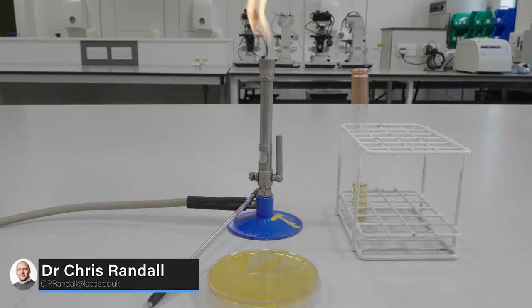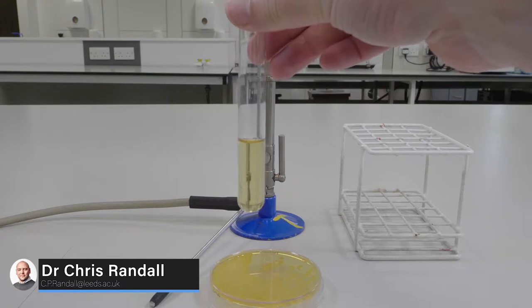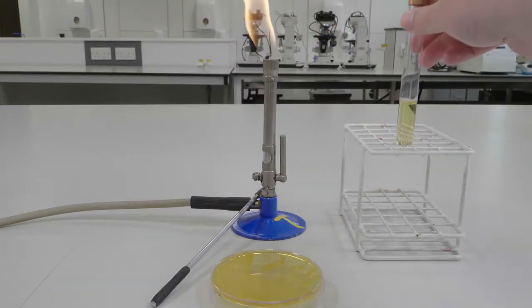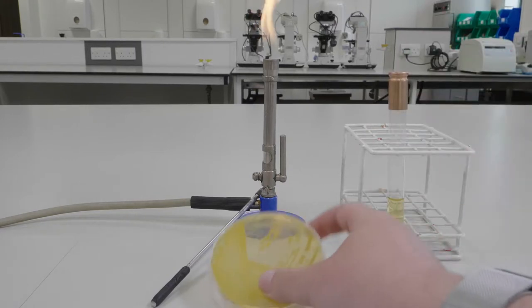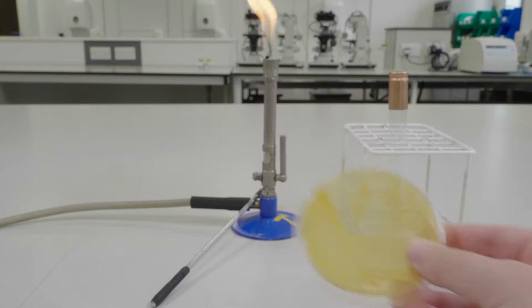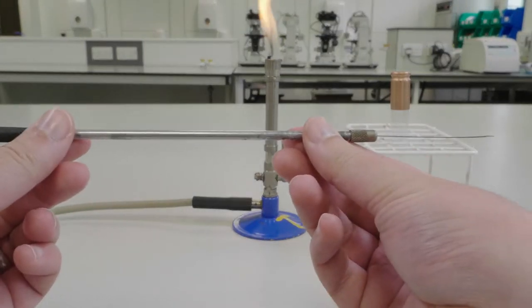In this video we are going to show you how to inoculate a sterile liquid culture medium with a bacterial colony. For this technique you are going to need a test tube containing sterile nutrient broth, your bacterial culture on a solid culture medium, and a culture loop also known as an inoculating loop.